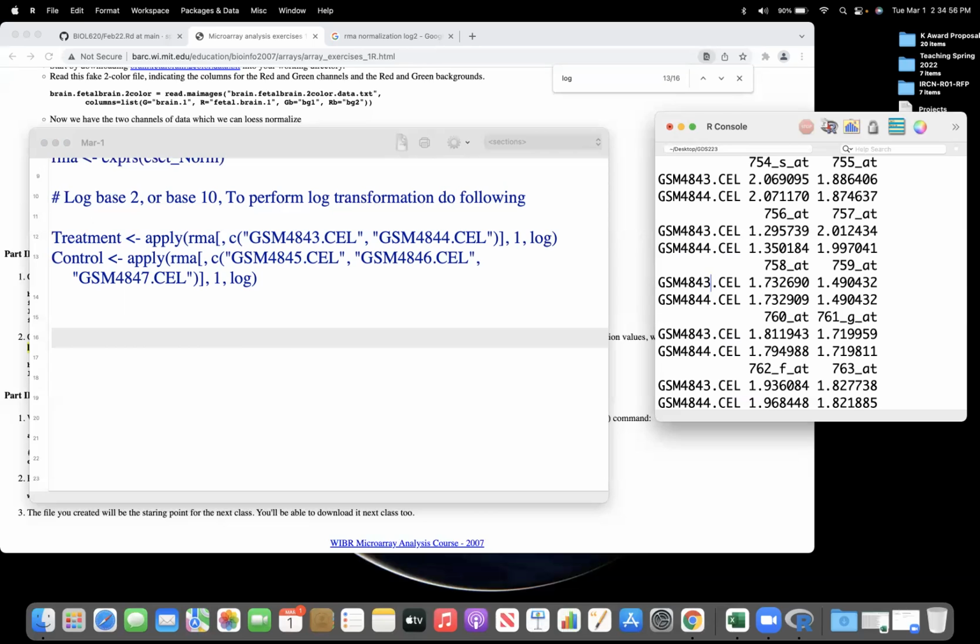Well, I think I tried to get something. I want to show it. I want to try and run one now and write it from the terminal. Yeah, let's do that. 160. Let's see.